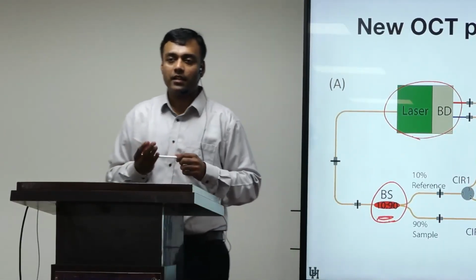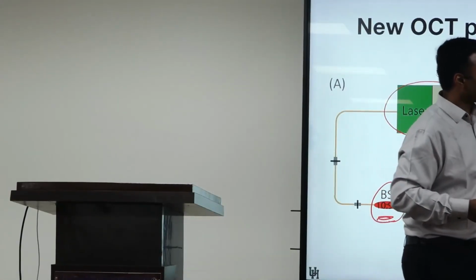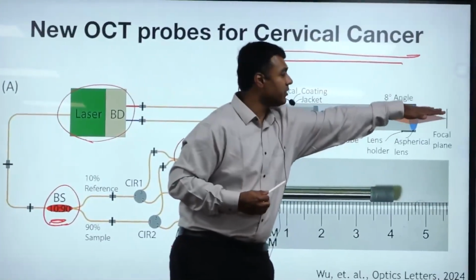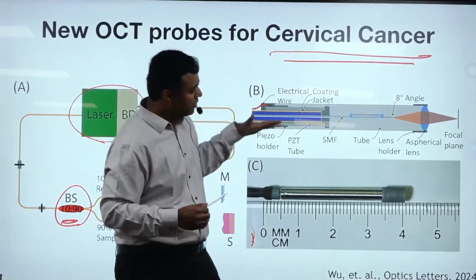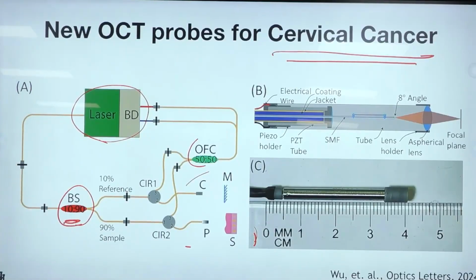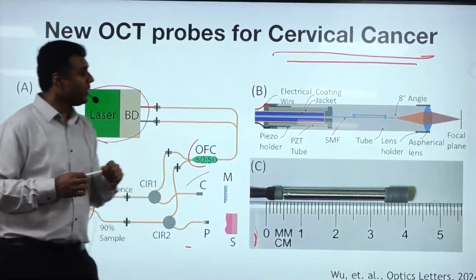That's the essential idea behind this approach. So this way we can do a big area scan, relative to this size, with a piezo which moves just a little bit. So that's one of the key things that makes this device work.